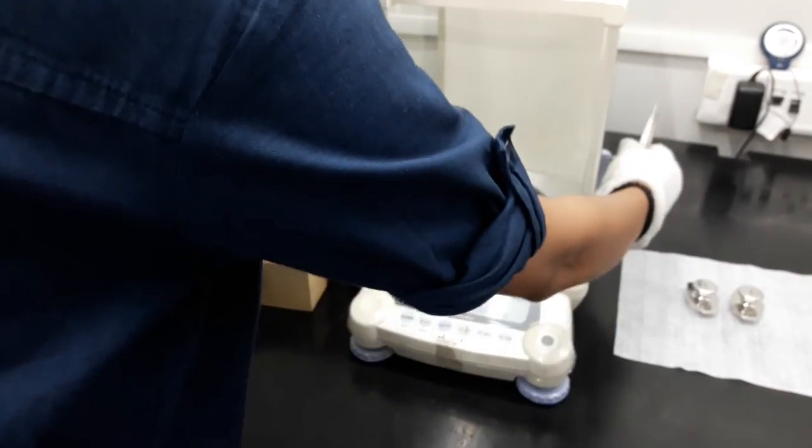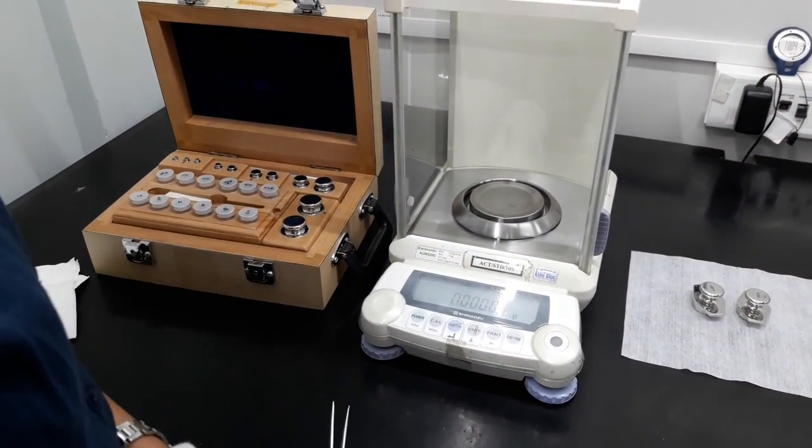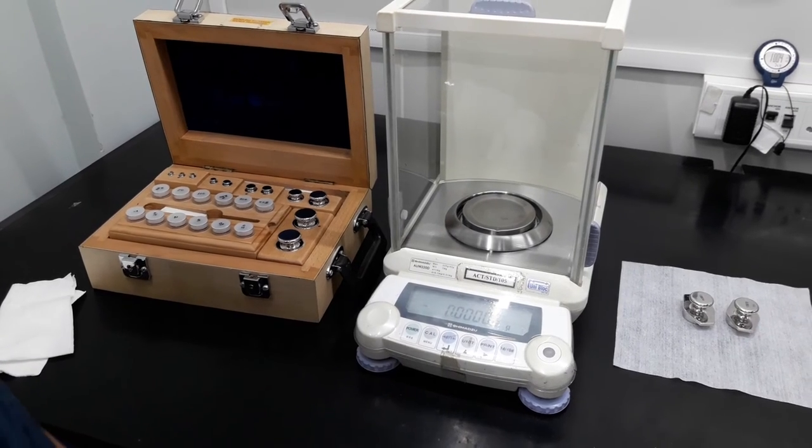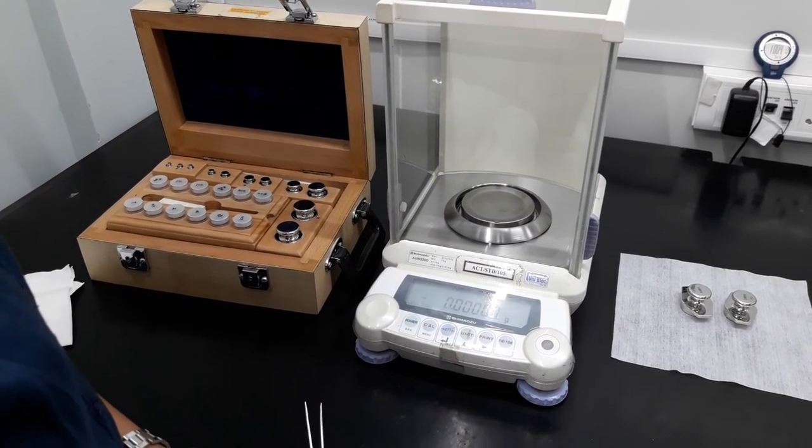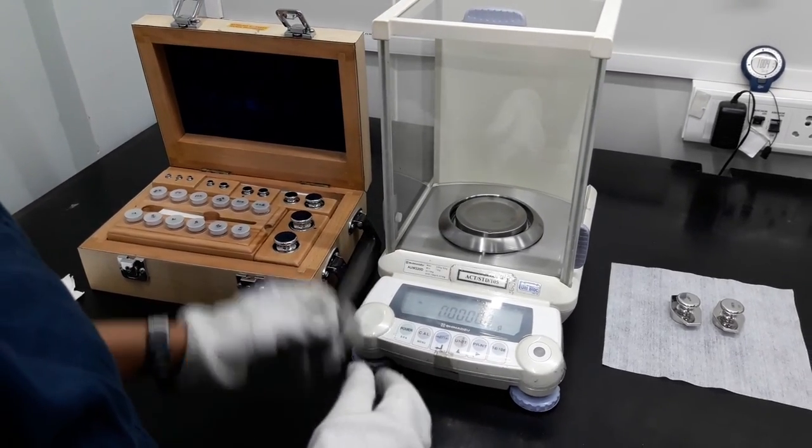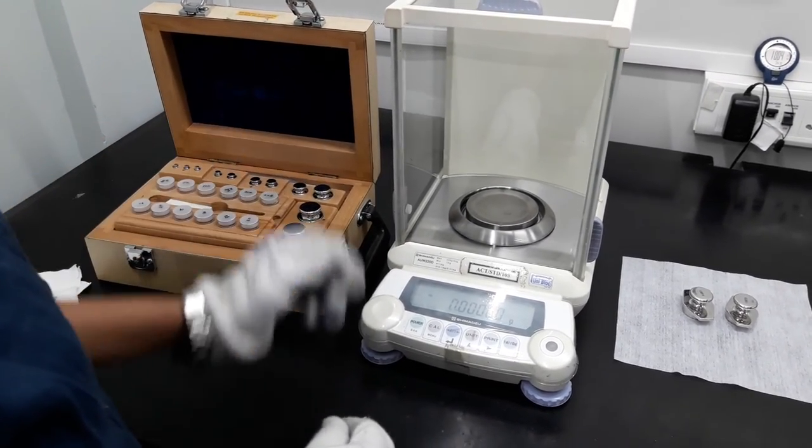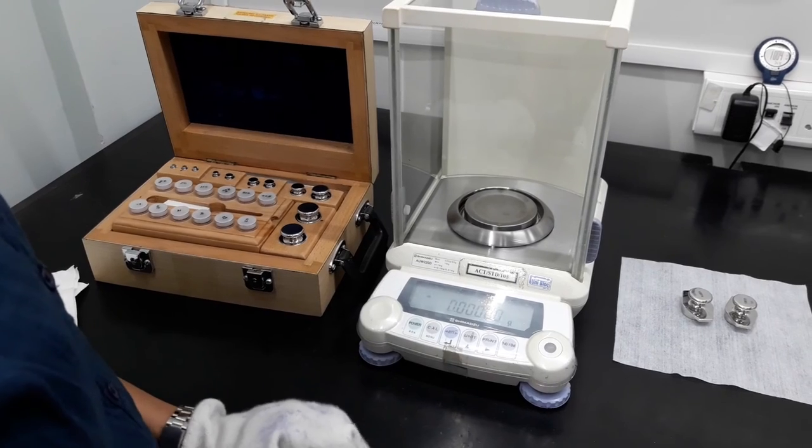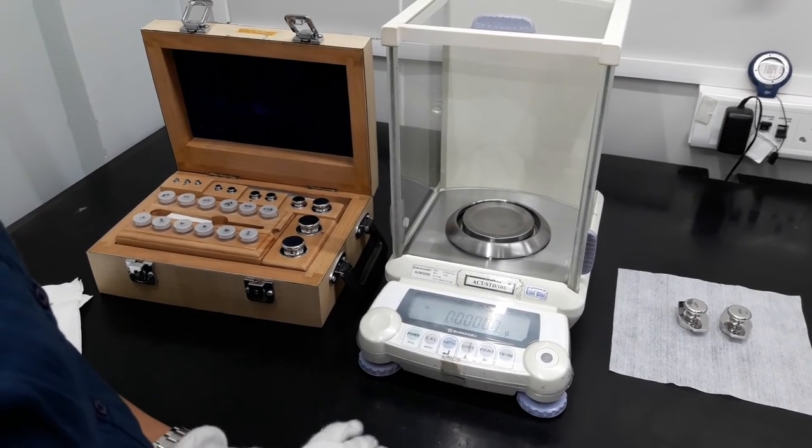Repeat the procedure one more time. Minimum 2 numbers of ABBA weighing cycles are taken for E2 class weights calibration, and 1 number of ABBA weighing cycle is taken for F1, F2, M1, M2, M3 and industrial class of weights: Class 1, Class A and Class B.